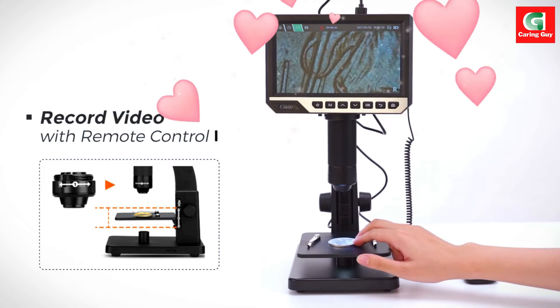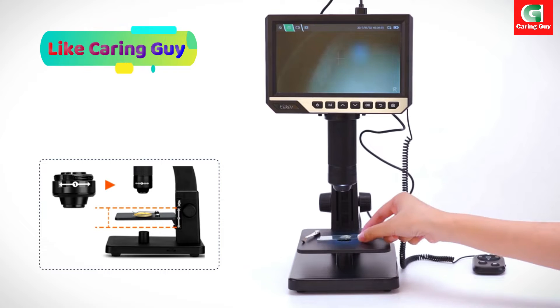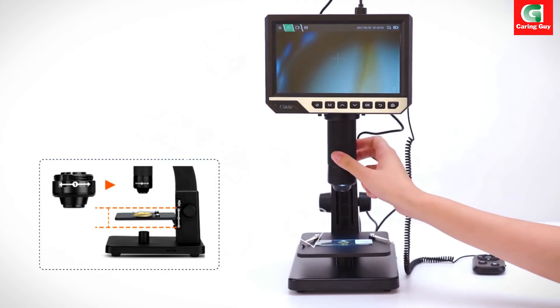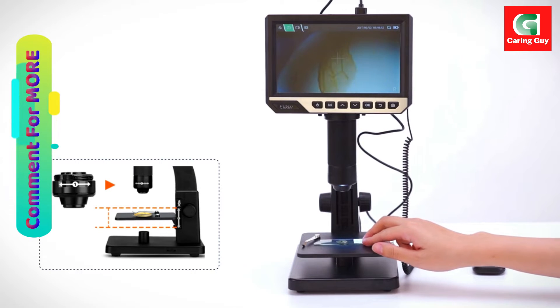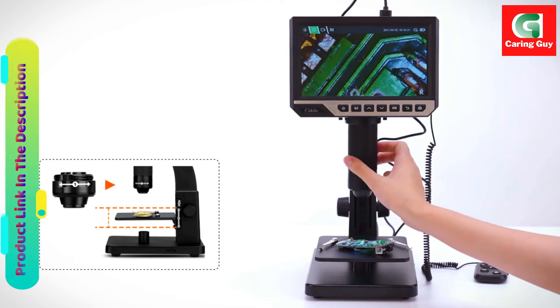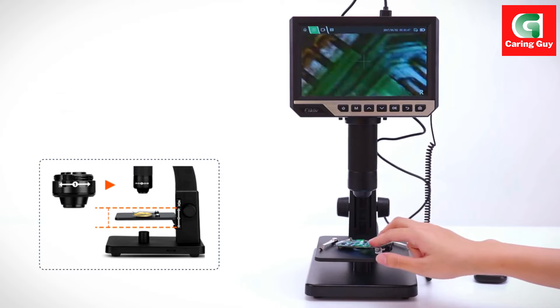The Elicliff microscope introduces an innovative concept with dual lenses, combining a digital lens and a microbial lens in one set. This creative approach ensures practicality and convenience, allowing users to meet the requirements of different fields with a single device.